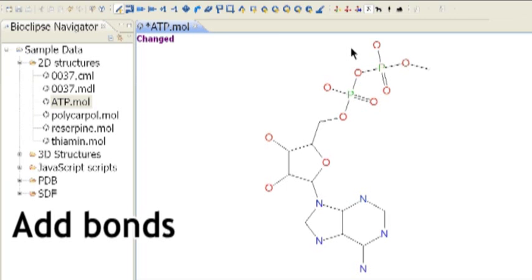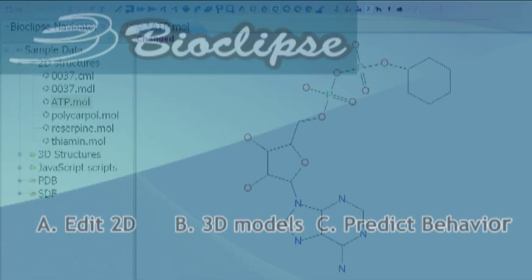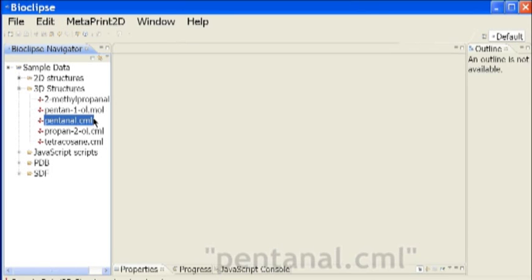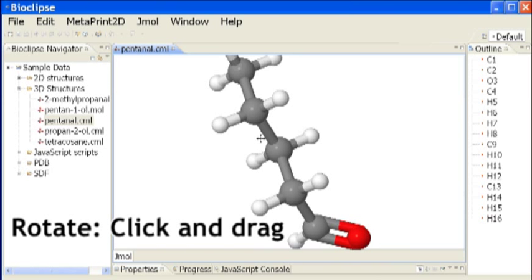Bioclipse provides 3D modeling by integrating JMol. From the left navigator 3D structures folder, open pentanol.cml. To rotate the molecule, click and drag within the view panel.